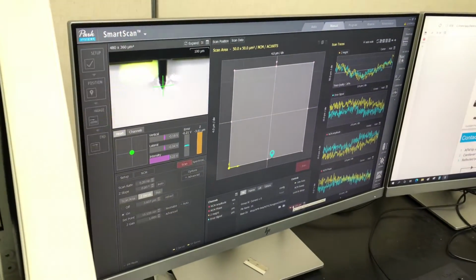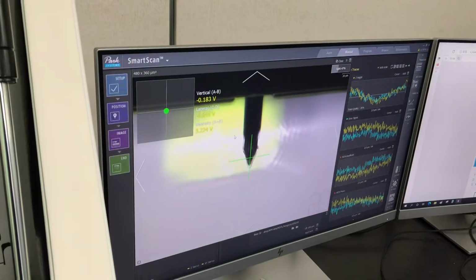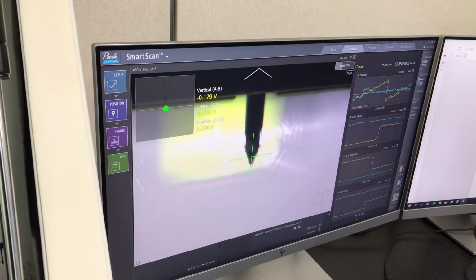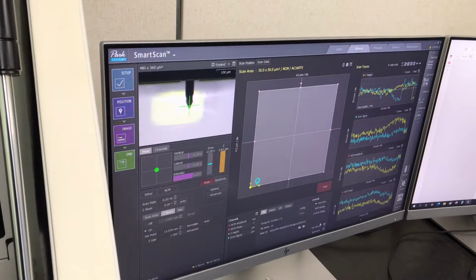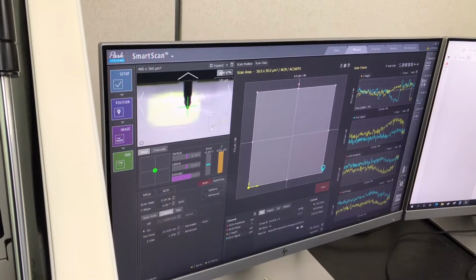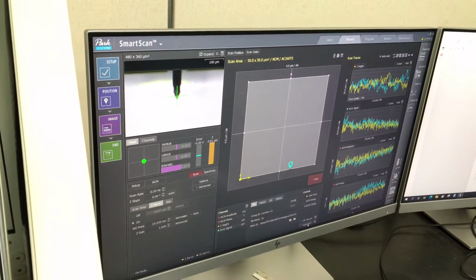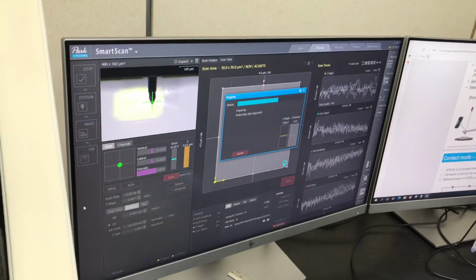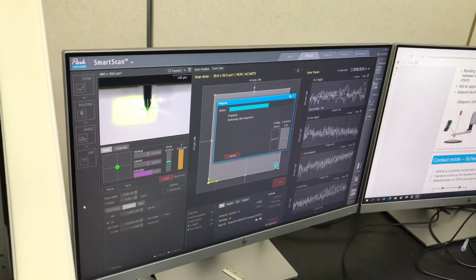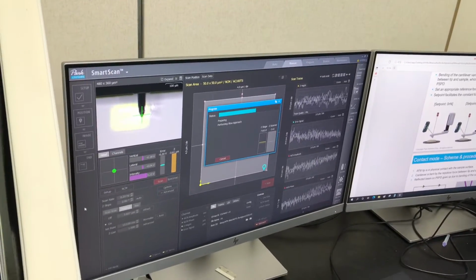Okay, more push, okay, and then you can move this side, and then you can approach mode. Okay, like this. So then again it starts to focus.